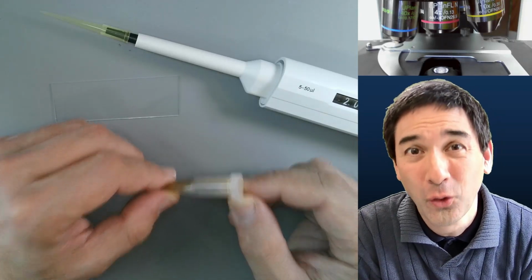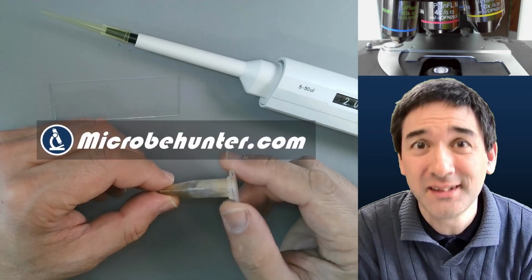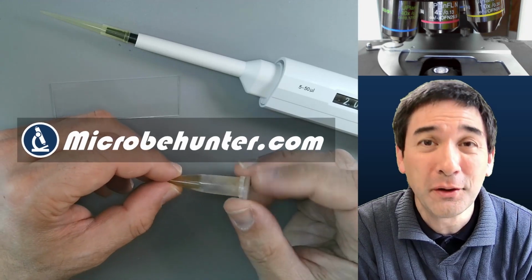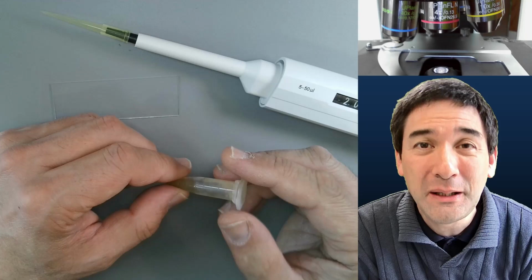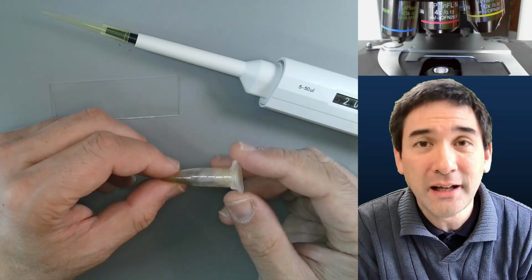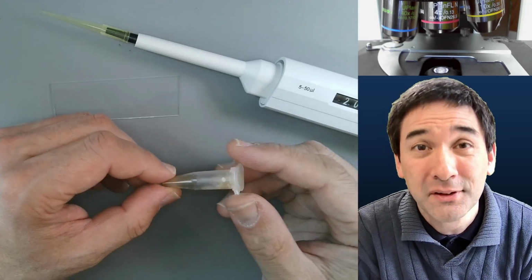Well, over a year ago, I prepared some yeast cells and I put them into this little plastic tube here, and I completely forgot about it. And now, a few days ago, while I was cleaning up all of my equipment, I rediscovered it, so to say. And today, I would like to put it under the microscope, and I would like to see what happened to the cells.